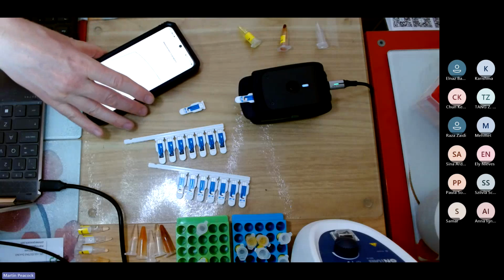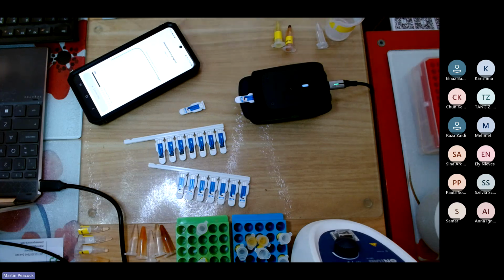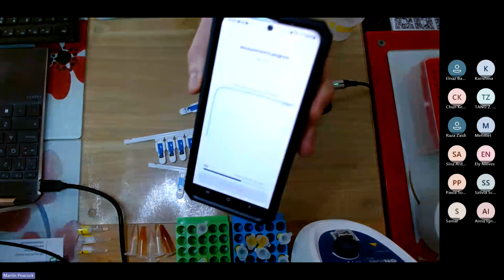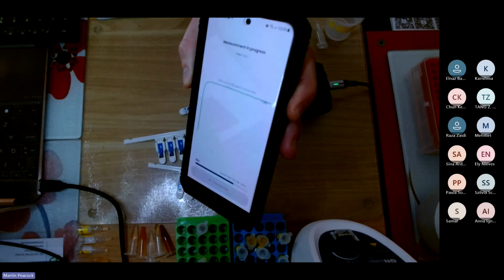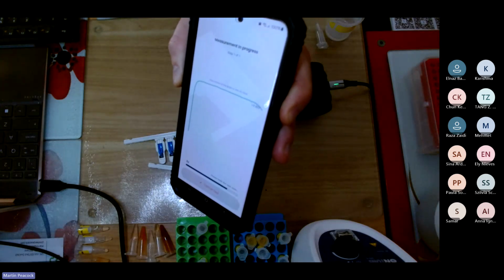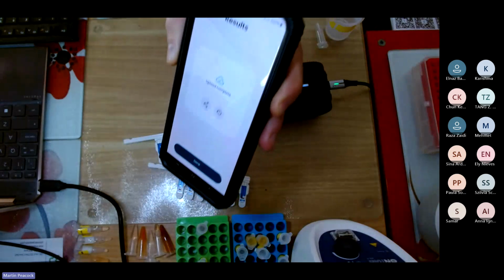Don't develop procedures that take a long time to do. It's an MIT philosophy, that one's got to fail fast. You don't want to be waiting around a long time to do scientific experiments. I know sometimes science does take long, but in this little domain of electrochemistry and screen-printed electrodes, I can understand if you're doing a 3-day experiment, that's one thing. But if you're developing point of care assays and it takes a long time to run, it's a drain on your time, and imagine one day somebody tries to use that assay in the real world, and you say it takes 20 minutes. The patient's left by then.